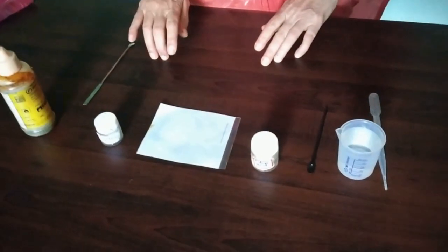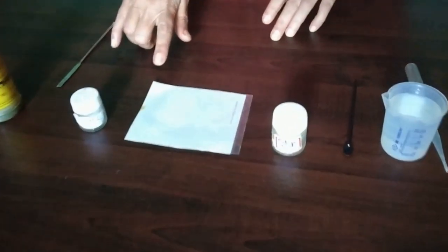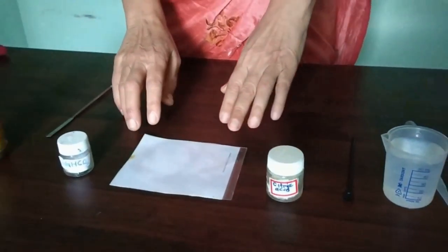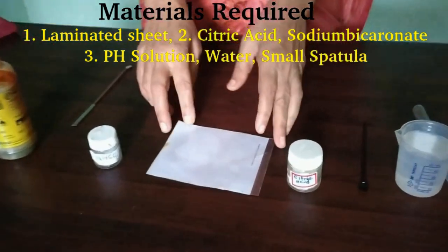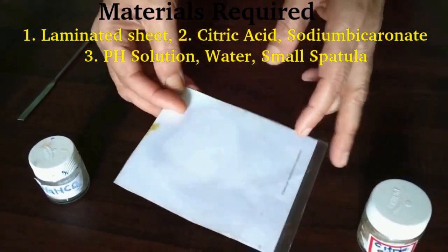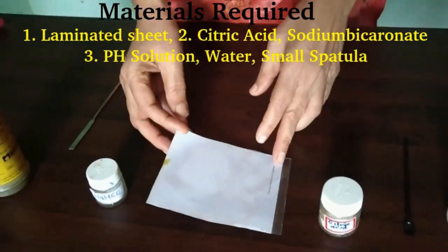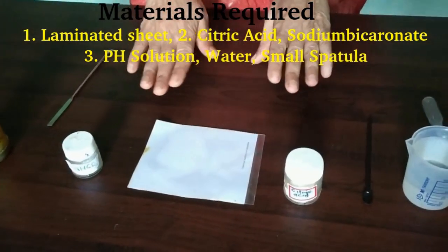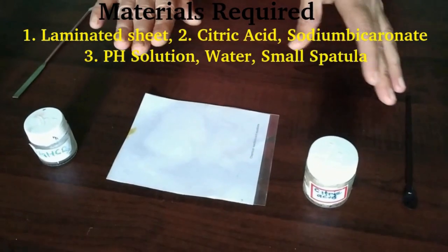The first one that we are going to do is neutralization of an acid with a base on a laminated sheet of paper. I have taken here a piece of laminated paper. If you do not have a laminated sheet of paper, you can just keep a plain paper and cover it with a plastic sheet. That will serve the purpose.